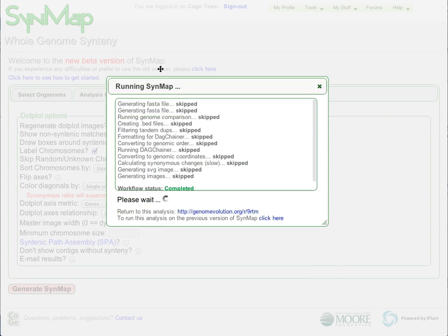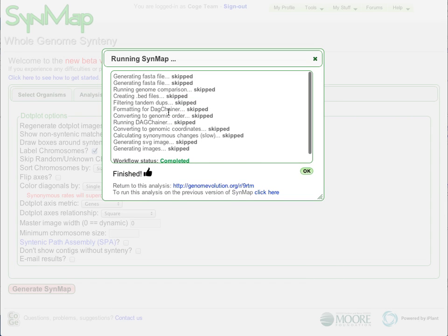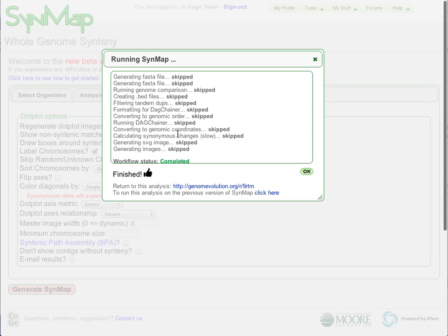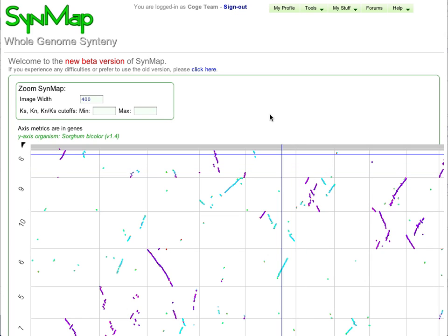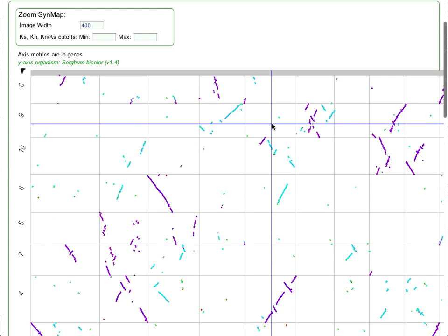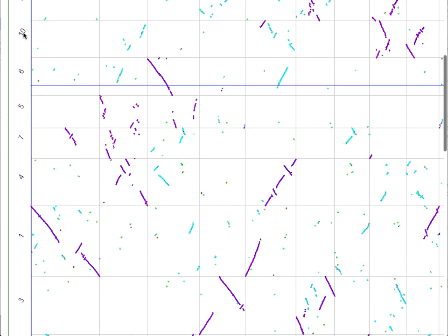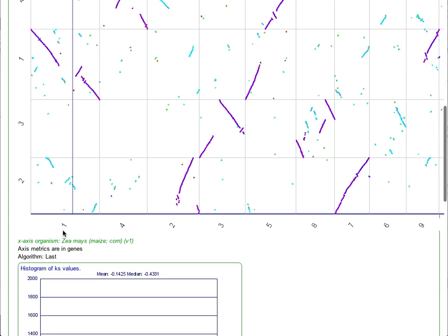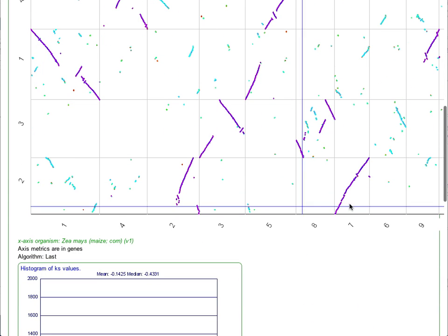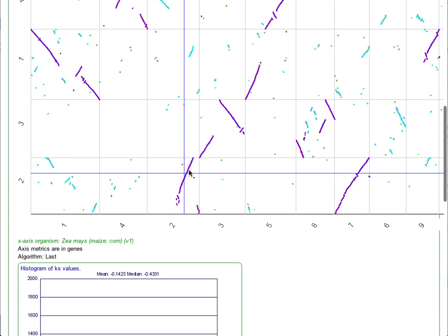As these analyses run, they use CoGe's powerful job execution framework that keeps track of which stages of which analyses have been previously run so that they can be skipped over as necessary or recomputed if requested. When the results come back, they're in an interactive dot plot with the sorghum genome on the y-axis and the maize genome on the x-axis.